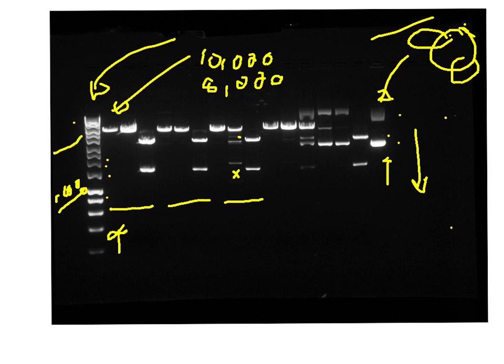And if you have a quick look at the DNA bands here, we can see that this band just above it, just here, is 6KB approximately, and then we get 5 and 4 and so on. And then we've got the band next to it which represents a DNA fragment cut, which is PGLO cut with the restriction enzyme EcoR5, and although there's more of it there, the size is pretty much the same.